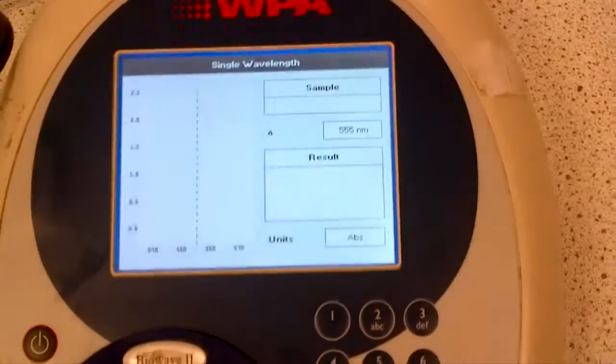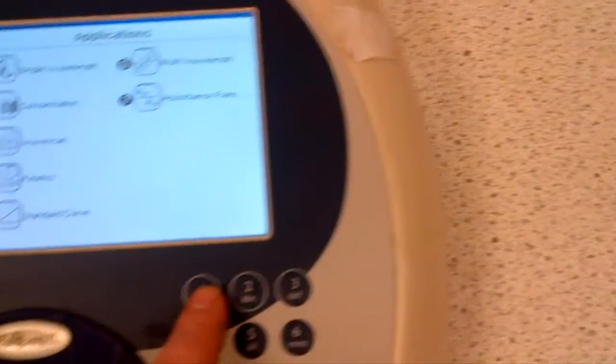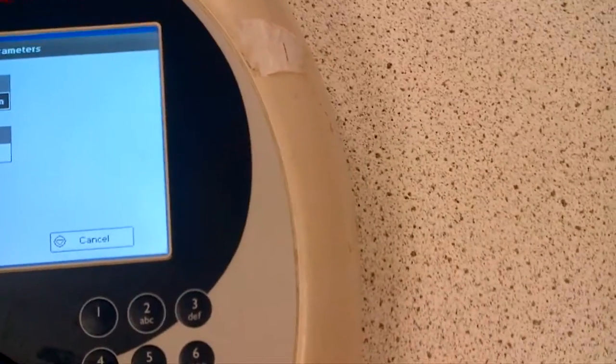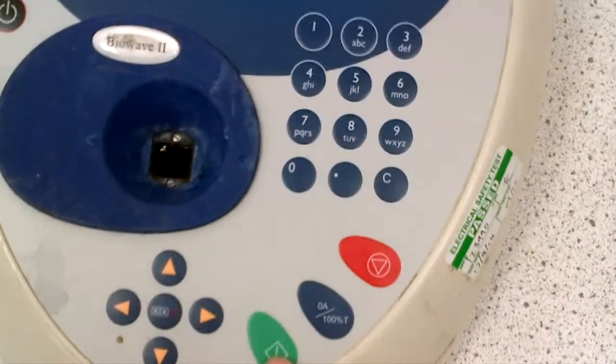So we're happy with 450, so press 1, clear out, and go back to 450. And again, it's the green button.